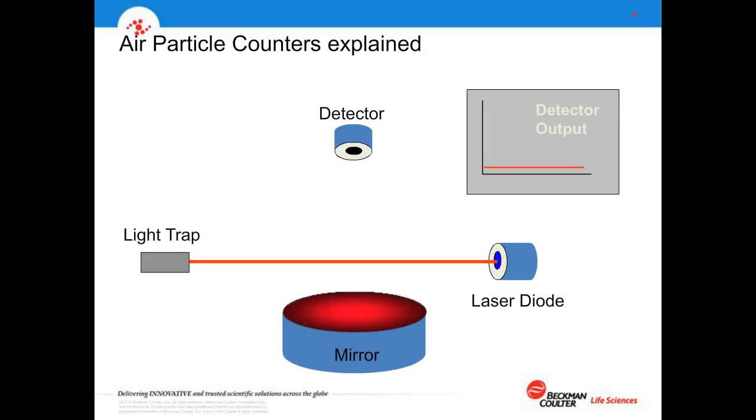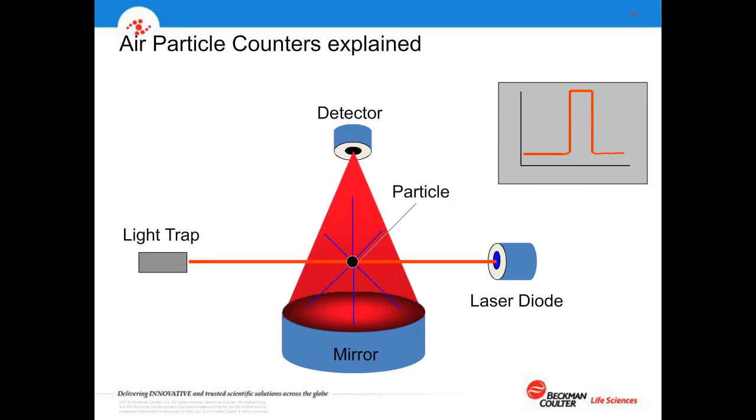So just briefly on the particle counter, we look at this particular instrument and what it does, and this goes to the classification side of it now, getting to look at the 21501 document in particular. Basically, a particle counter uses bright light in a mode known as light scattering to detect particles. So we have a beam of light, today it's typically a laser diode, and we pass particles through that. As a particle gets into the beam, it scatters light. From that information, we understand A, an event occurred, and B, by the amount of light scattered, we have an idea of the size of the particle. And this happens very, very quickly, within actually milliseconds, as that particle moves through the beam.